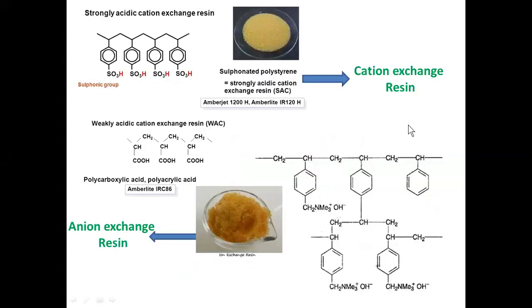You can see here the general structures of resins. Of course, I will explain how you synthesize the resin, and what chemical reaction is going to take place during the preparation of the resin. We shall understand about that later.